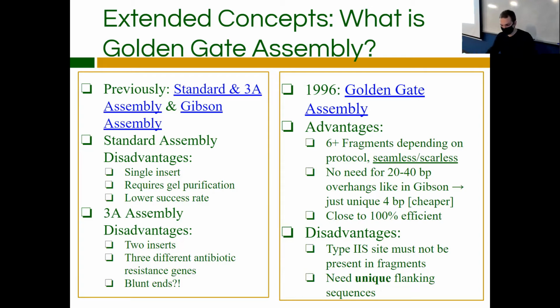So what happens is you have your unligated parts in the solution, and as they're being ligated together, it's a one-way street. So it doesn't go backwards. There's a 50-50 chance that the ligation is going to work or just recombine to what it was originally. I will get into this in the next slide just to make the visuals more understandable, right?